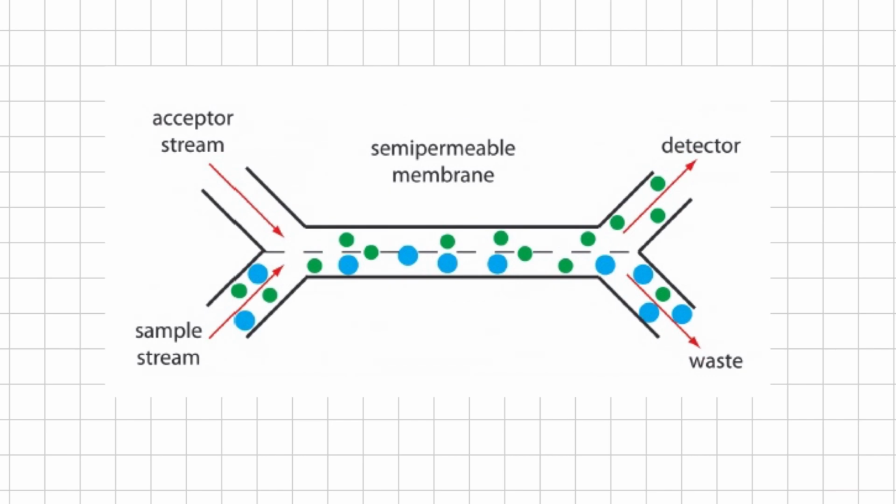As the sample stream passes through the separation module, those species capable of crossing the semi-permeable membrane do so, entering the acceptor system. This type of separation module is common for the analysis of clinical samples such as serum and urine, where a dialysis membrane separates the analyte from its complex mixture or matrix. Semi-permeable gaseous diffusion membranes have been used for determination of ammonia and carbon dioxide in blood. A typical separation module for a flow injection analysis using a semi-permeable membrane is shown in the figure.